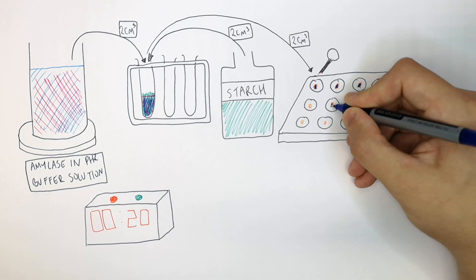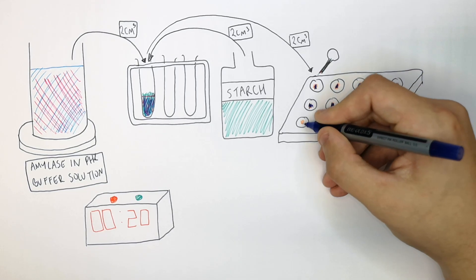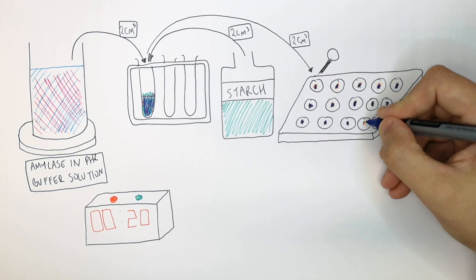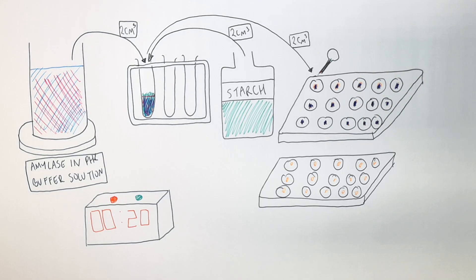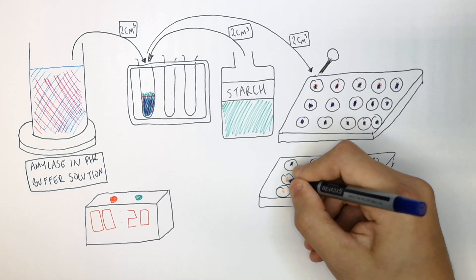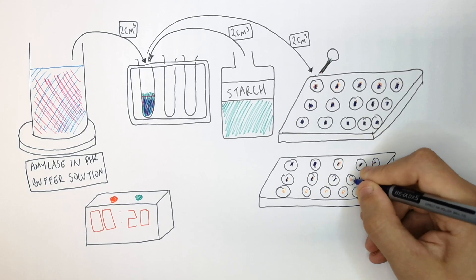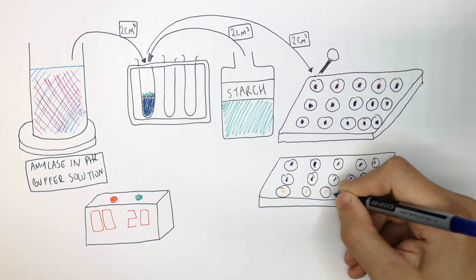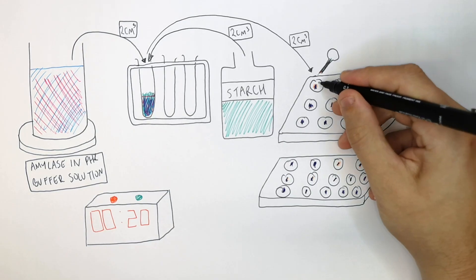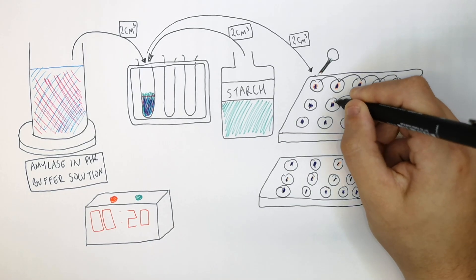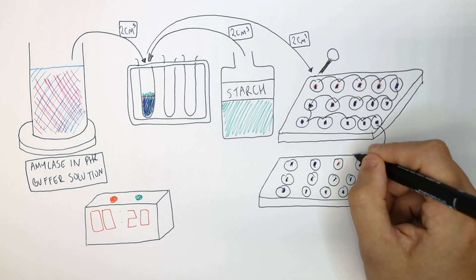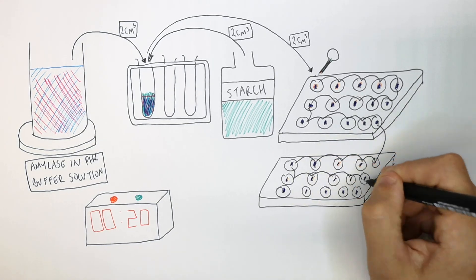The iodine remains blue, indicating the starch is not being broken down. If you need to continue to another plate, do so — the starch is still not being broken down. At around 600 seconds with no breakdown observed, you have to consider that something may have happened to the enzyme.